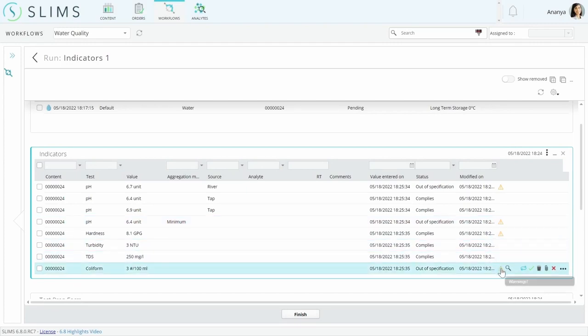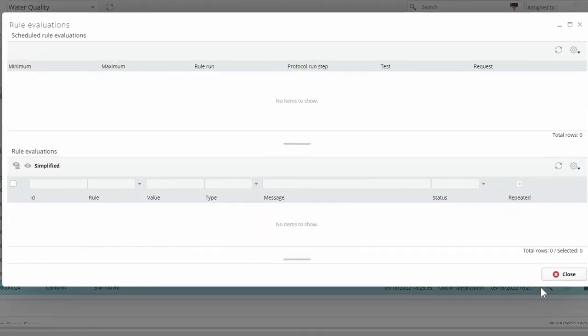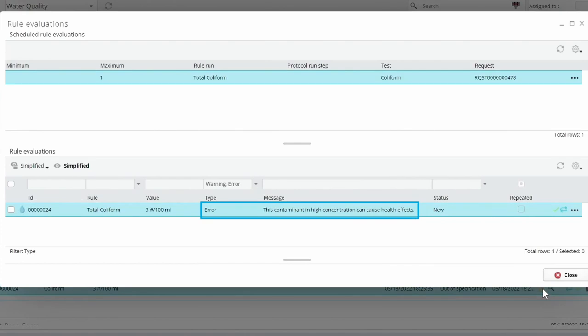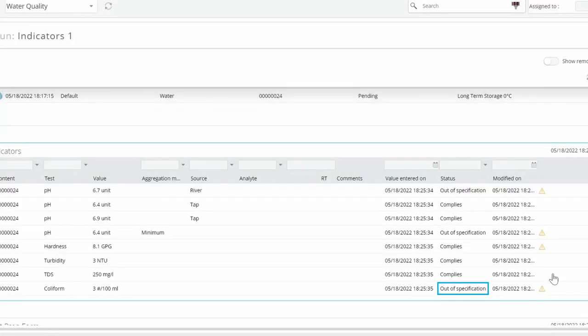The coliform result has a custom error as well, which uses a different specification type. In this case, we're calling attention to a contaminant that could be threatening in high amounts. An error requires the result to be validated by the reviewer.